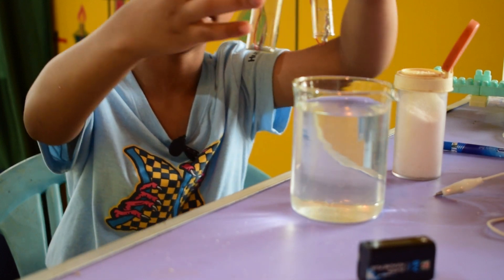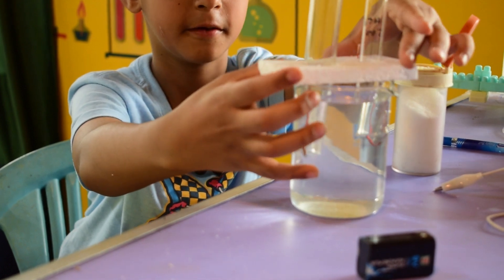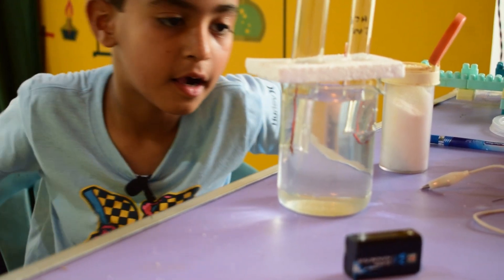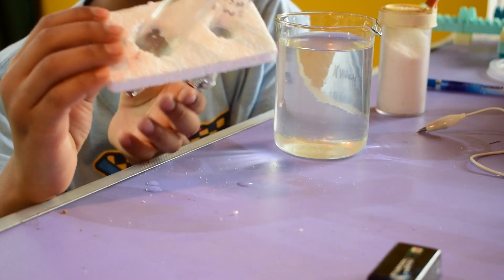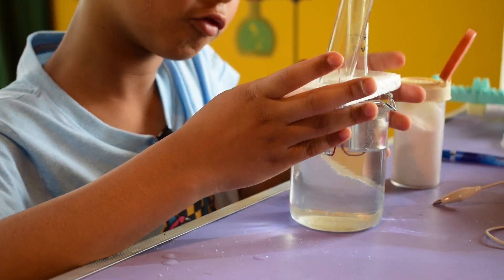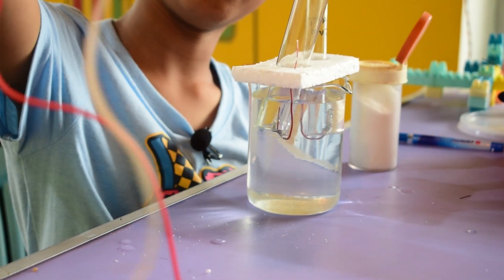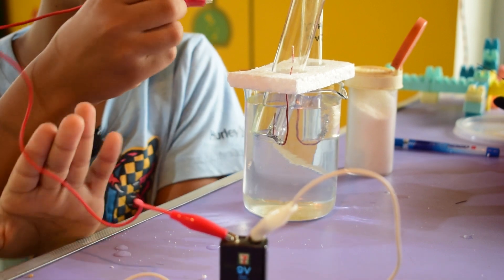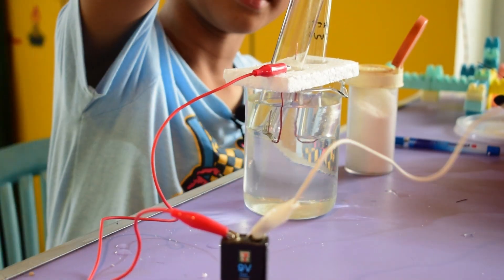Now I will install this in the glass beaker. Look how I install the electrodes — we will put the test tubes, the styrofoam, and the electrodes inside the glass beaker. Now I can install the battery with these wires onto the electrodes.